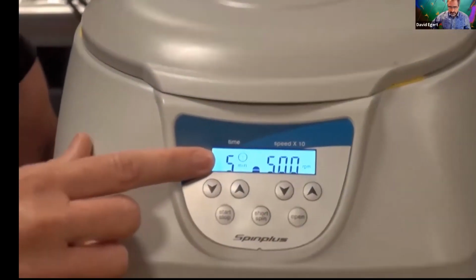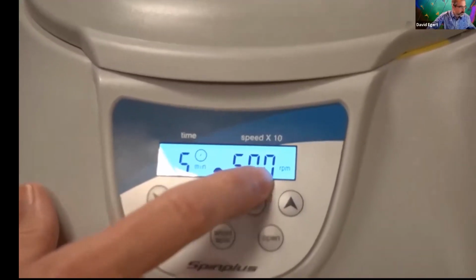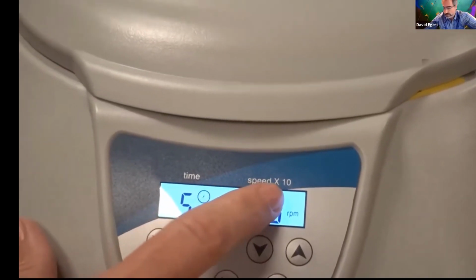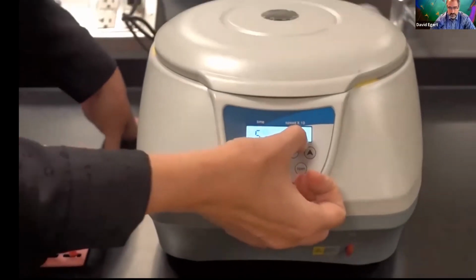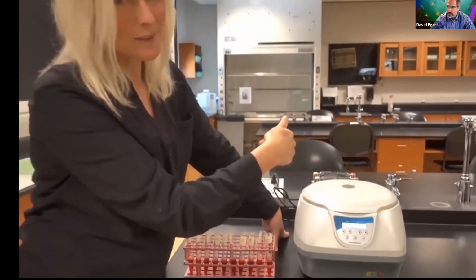So we're going to spin these for 5 minutes at 5,000 RPM. You might go, well, it's only saying 500, but if you look up here, it says times 10. So 500 times 10 is 5,000, so this is good to go. RPM means revolutions per minute, so that means it's spinning 5,000 times per minute.